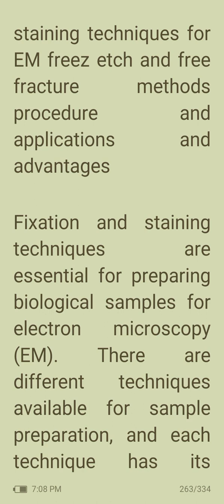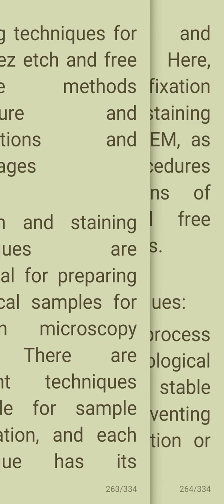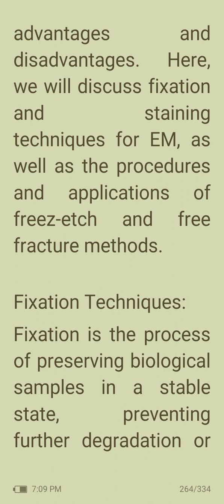Different fixation and staining techniques for electron microscope. Fixation and staining techniques are essential for preparing biological samples for electron microscopy. There are different techniques available for sample preparation, and each technique has its own advantages and disadvantages. Here we will discuss fixation and staining techniques for electron microscope, as well as the procedures and applications of freeze etch and freeze fracture methods.